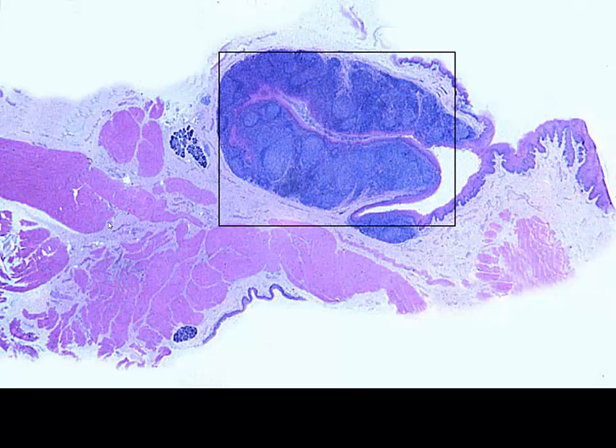But I hope you can get an appreciation for how much larger this is than what we're going to see in a lingual tonsil. And that size difference in scaling is going to be a big way that you tell the difference between the one smaller crypt and a smaller organ on the side of the tongue versus this humongous structure that's in the back of your pharynx.